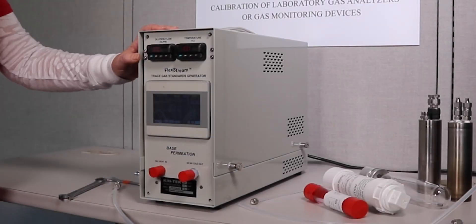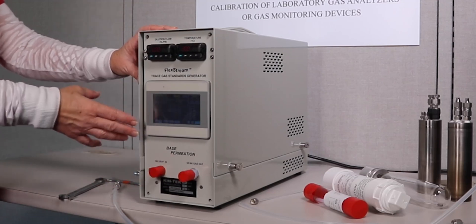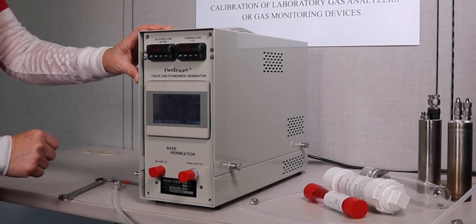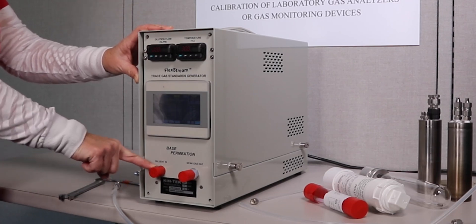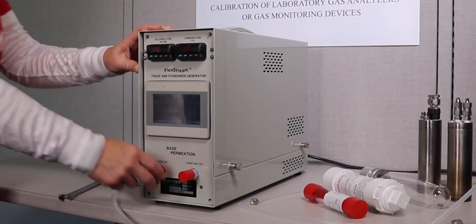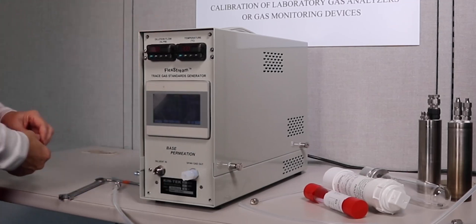Here we have a FlexStream base module that was recently unpacked. It still has red caps on it. This particular unit has already been powered up, but we're going to go ahead and connect our dilution gas with our diluent gas in port and then our span gas outline. So what we want to do is first remove these red caps. That's how it gets packaged and shipped.